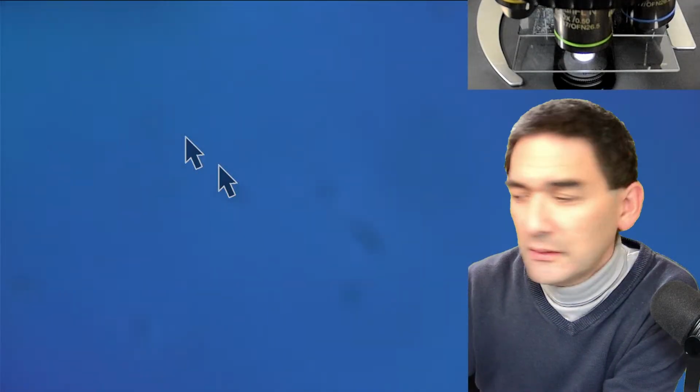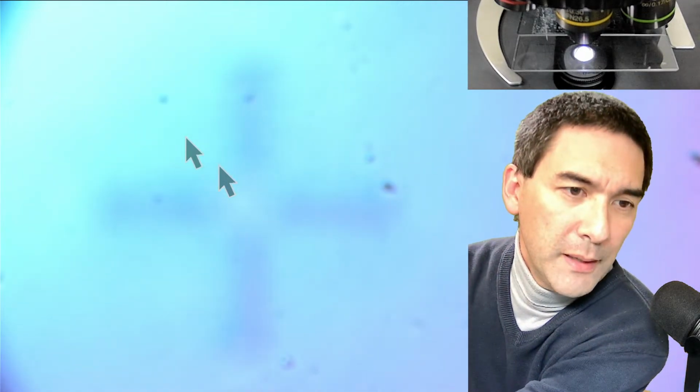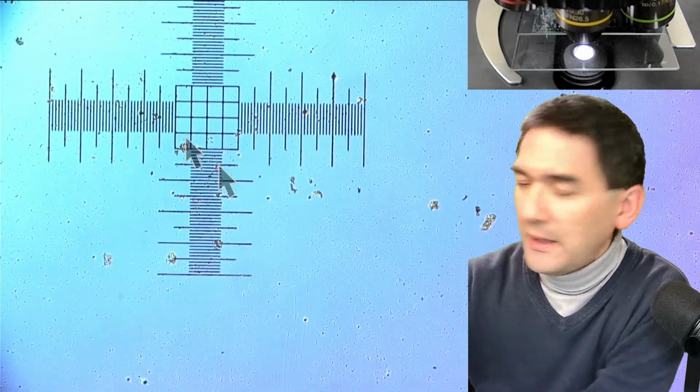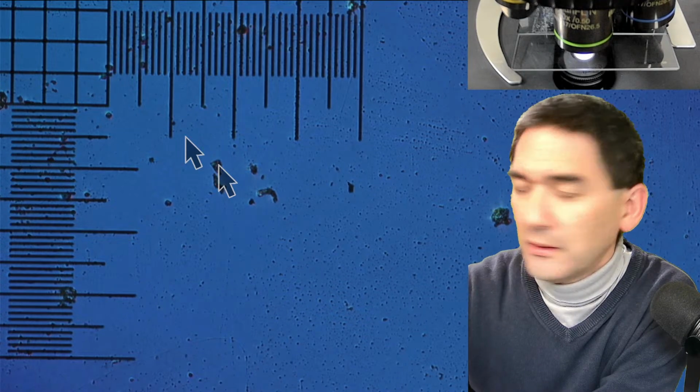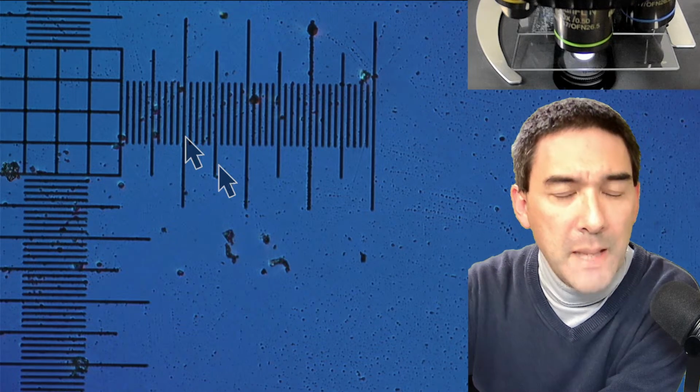Yeah, so here we see already the scale. I was doing this at 20 times magnification. Oh, I lost it again. Always center it and focus before you go up with the magnification. That's rule number 1 in microscopy use. So here we go. I'm at 20 times, so from one line to the next line is 10 micrometers, which is approximately the size of a human cell.